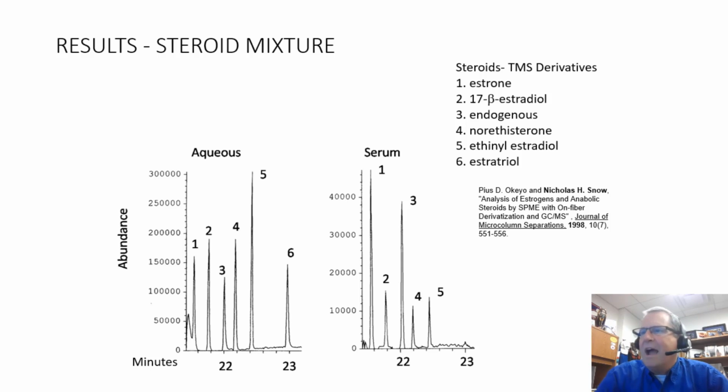The first macro for the rail auto sampler was actually written by a person from the manufacturer in our lab to help us in our lab. They wrote the macro for it in our lab, and I was too kind. I just let them take it back with them. But now that capability exists on all of those auto samplers now.